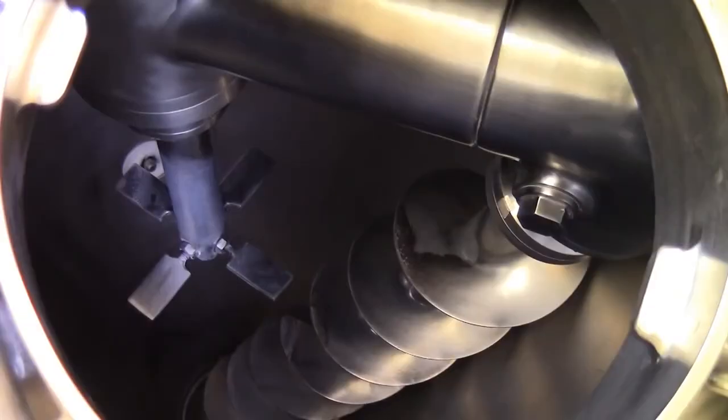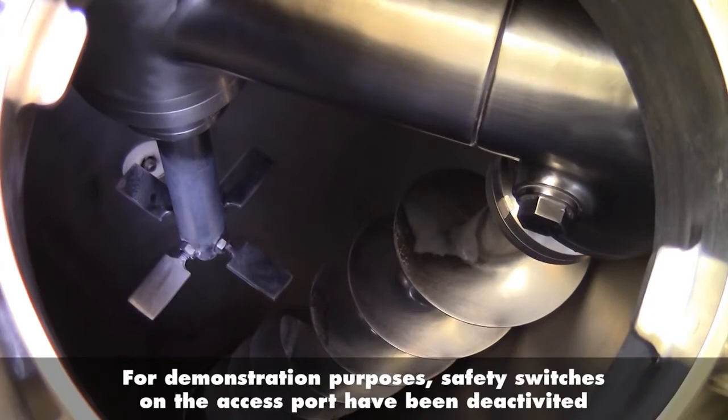Looking inside the mixer we can see how it operates. The auger off to the right runs down to the bottom of the vessel and is supported by the orbital arm at the top. In the center is an intensifier, which is optional.